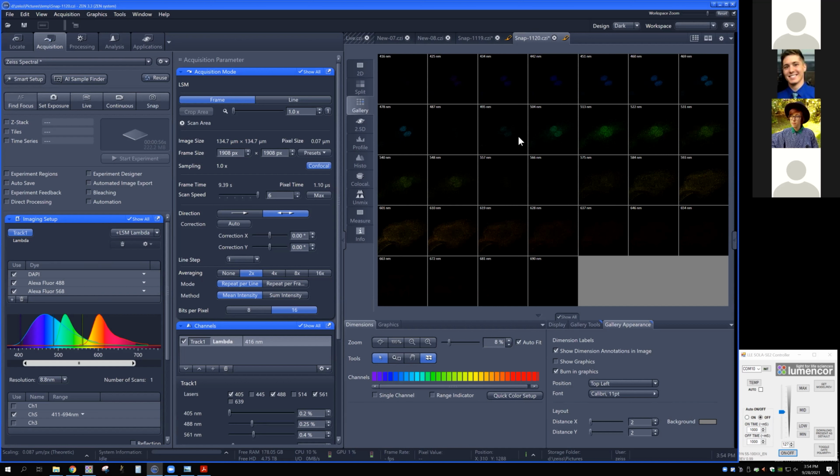The green, in contrast, really picks up here after the 488s or 495 or so. This channel is dark because we have that filter in place for the laser. And so we're blocking out a lot of signal by using that main beam splitter in this case. We have a little notch in our emission curve that we're used to seeing, and I'll show you what that looks like in a second. Same thing goes with the 561 here as well.